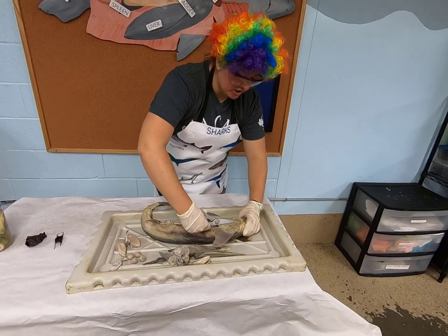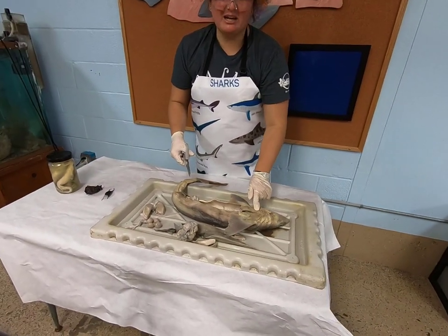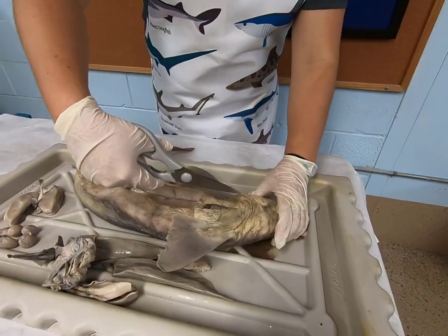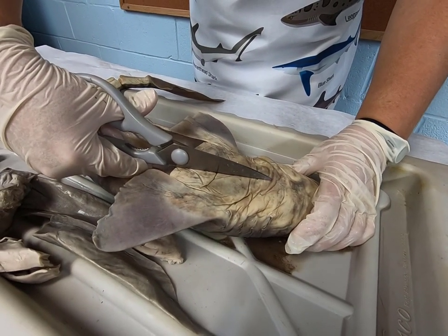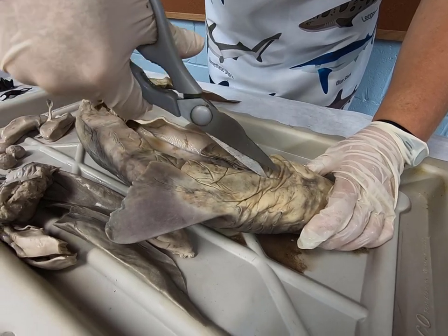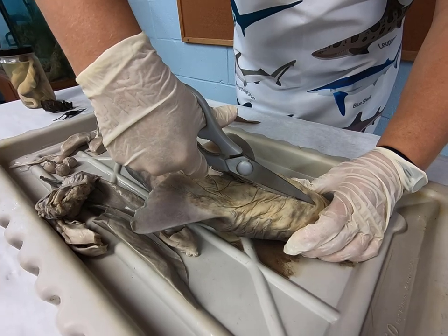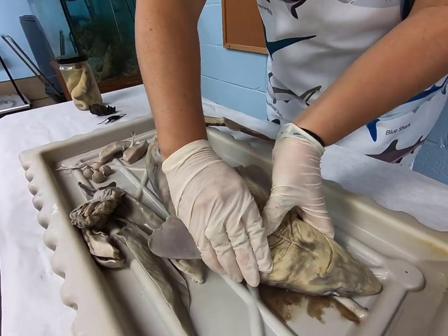Now, before we get to the heart, we actually have to cut through some cartilage right here. So you might be able to hear the sound of me cutting through cartilage. If I were to cut through bone, it'd be a lot harder, but the cartilage is pretty thick, especially right around the heart because they want to protect it, right? So let me get there. Oh yeah, that was a good little snap there. We go a little bit more shallow here, all the way up almost to the jaw, so we can try to see that heart.